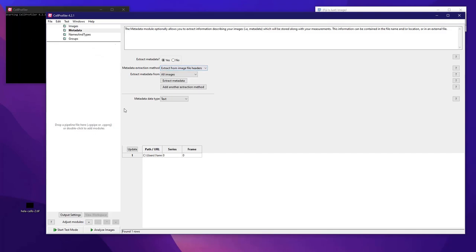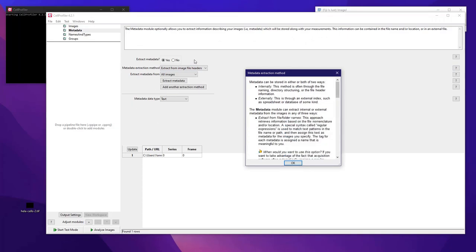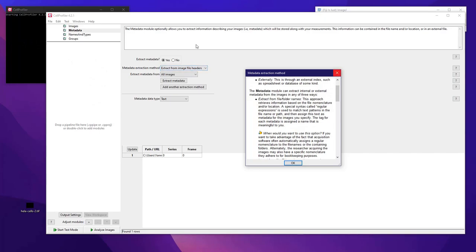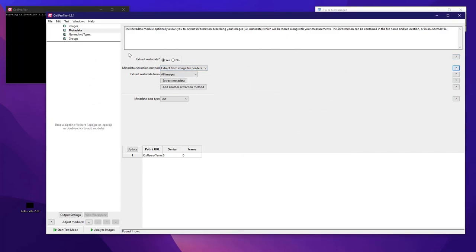I choose this option. This is a module like all the modules you will add later on in the pipeline, and they all look the same. From top to bottom you have instructions on how to configure the module. If you need help, you can click on the question mark next to the line you are focusing on and get contextual help for that specific function. Working in a batch fashion is built-in — so that's really the strength of this program.